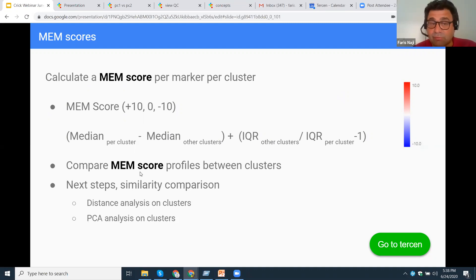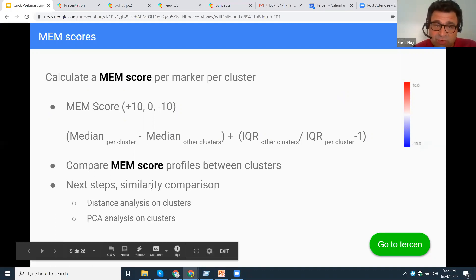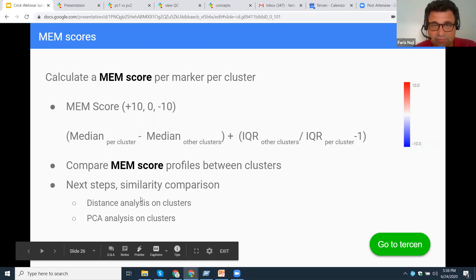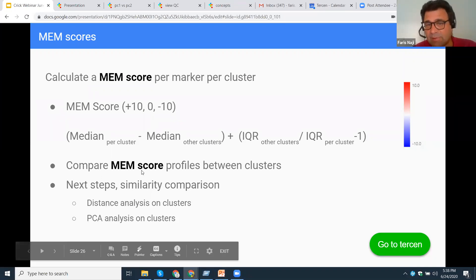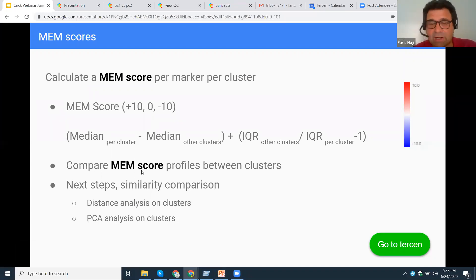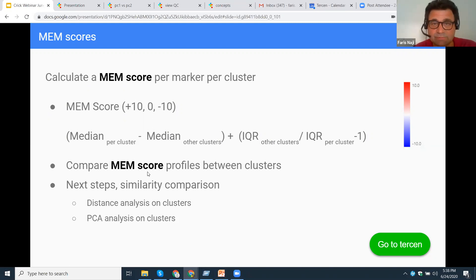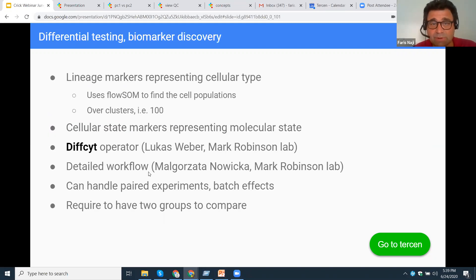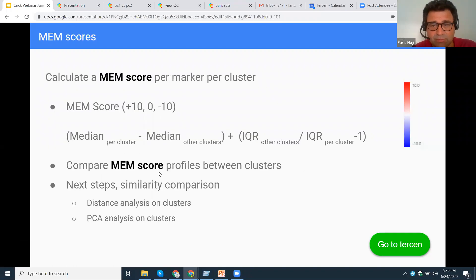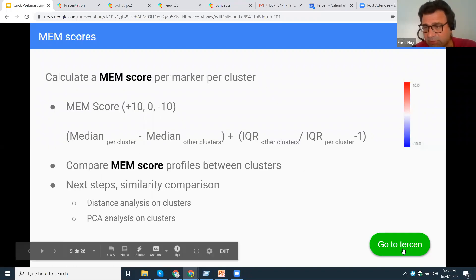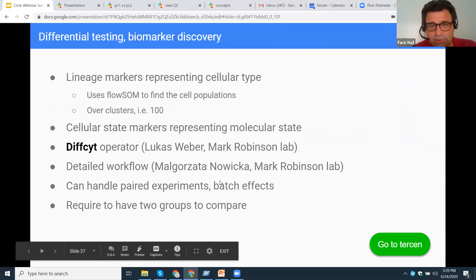You can perform analysis on MEM scores themselves — like a PCA or distance analysis. MEM scores become computable data. They're very machine-readable and understandable, and you can use them to actually appraise your clusters. Let me go back to Tersen to show this.